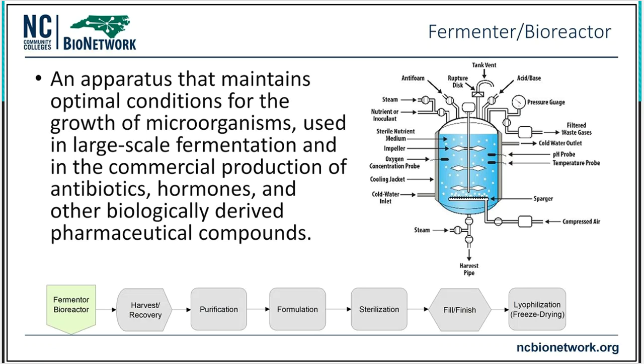So the very first thing down here at the very bottom, fermenter, bioreactor. What are those things? Well, here's a schematic. And I'm just going to read this little blurb and we'll talk about it. It says an apparatus that maintains optimal conditions for the growth of microorganisms used in large-scale fermentation and in the commercial production of antibiotics and hormones and other biologically derived pharmaceutical compounds.